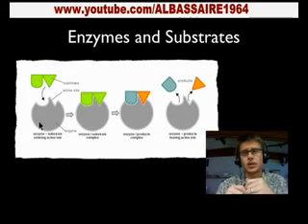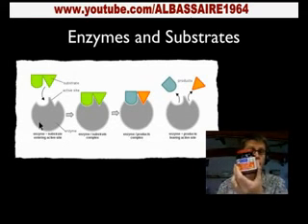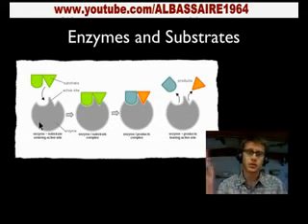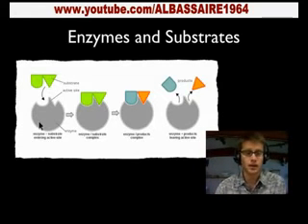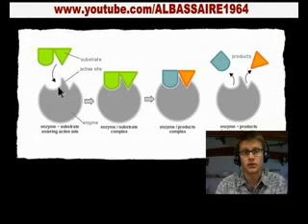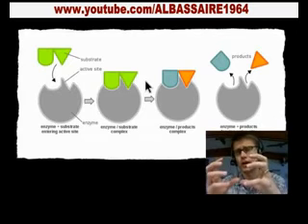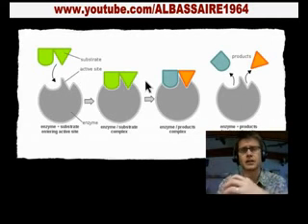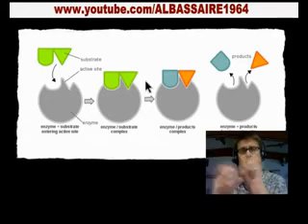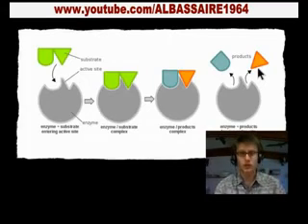And so in this case what we have is an enzyme which is called catalase that's sitting inside the yeast, and the hydrogen peroxide will fit into that enzyme, and what it does, it breaks it down. And so in other words, in this diagram here we have a substrate, a chemical that fits in. It then tugs on that substrate in some way. It makes a microclimate inside that enzyme, and what it eventually does is break it down. So in this case it breaks it down into two things. It breaks it down into water and then oxygen, which is given off.